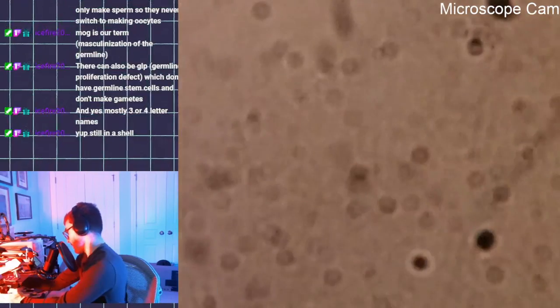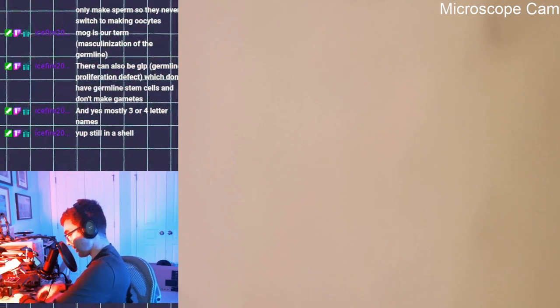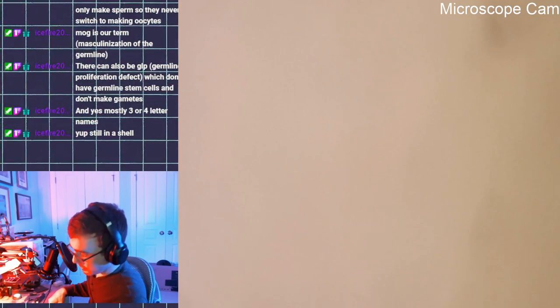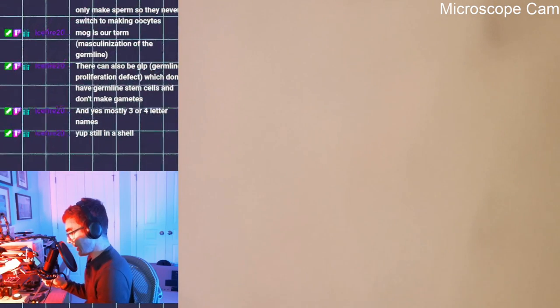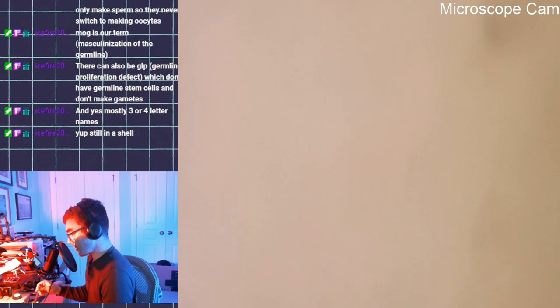Nothing much interesting. All right. Lake sample. It's probably going to be the last thing for today, but we'll see what's going on here. Maybe something interesting is happening. So I've been feeding it a combination of little bits of plant matter, a drop or two of milk every once in a while, which I had read was something that some of these microorganisms like, but that made it very, what's the word? Very oily on top, which is not good.